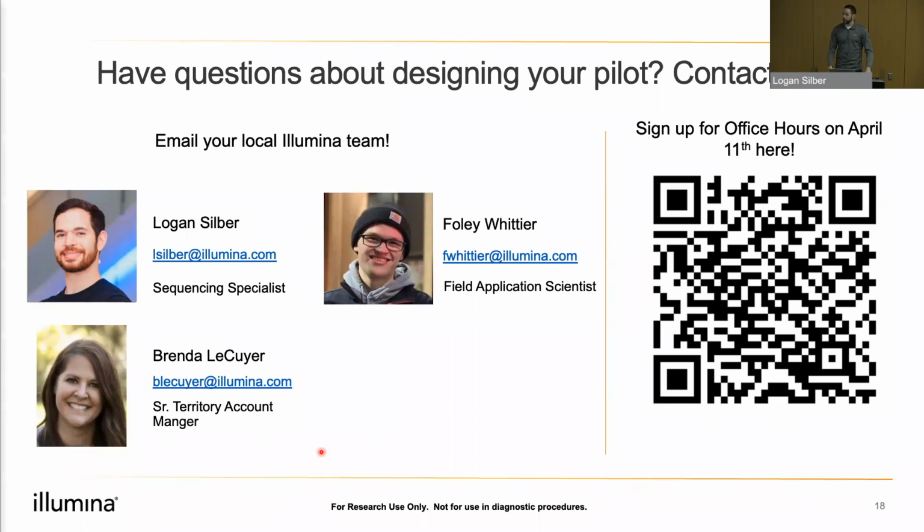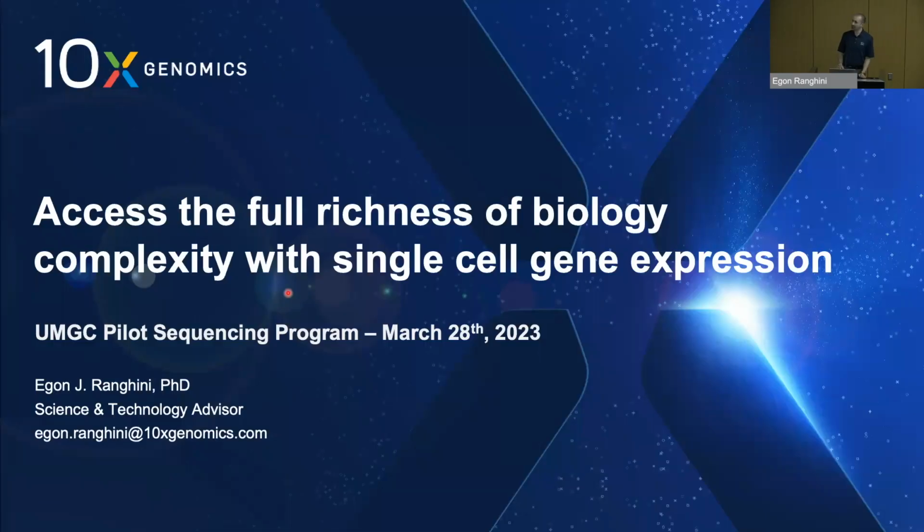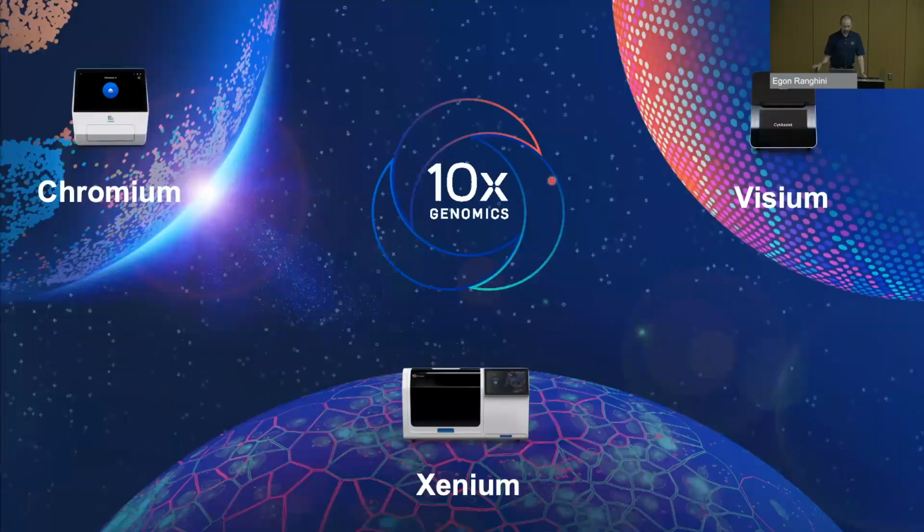So from there, I'm going to be passing along to Egon, who will be talking more about single cell RNA versus the bulk RNA that we've been discussing. So hello, everyone. My name is Egon. I'm the Science and Technology Advisor for 10X. I'll give you an overview of what we do, and then I'll also talk about what is included in the pilot project, or pilot program rather.